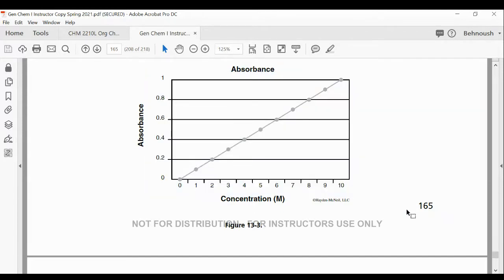You are going to make and construct your own calibration curve with the 5 solutions that you have in this experiment. So first of all, you plot a graph. When you plot a graph, you must have concentration, with the unit, and absorption, and then you find the data points, you connect the line, the best fitted line, and then you can use that as the calibration curve.